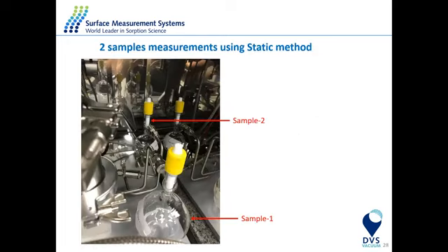So what it looks like: the solvents look like this. They are connected directly through the stainless steel flask to the vacuum valve, and then we are just evaporating the liquid. At the bottom, what you see here is sample 1, the liquid sitting at the bottom. A large surface area gives a larger evaporation rate, but the vapor pressure of the liquid in a closed system won't change, so you're not going to get any losses. And then you have the second liquid sitting at the back.